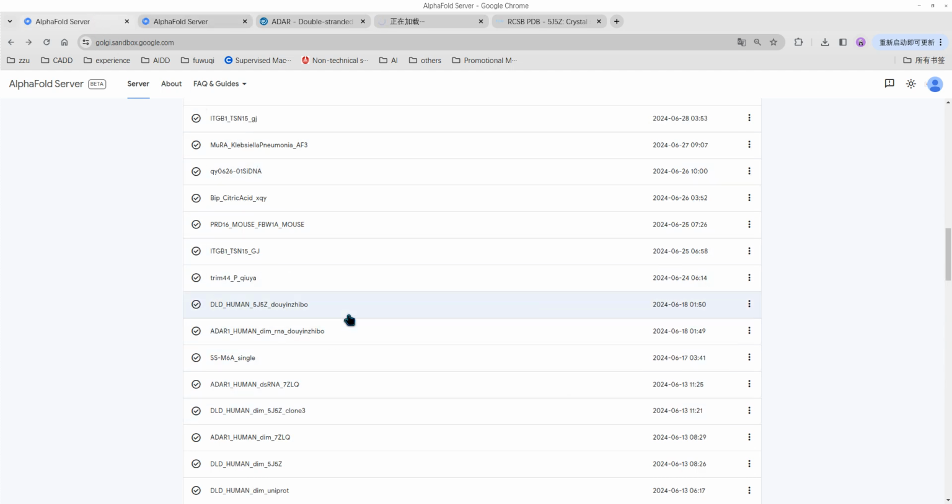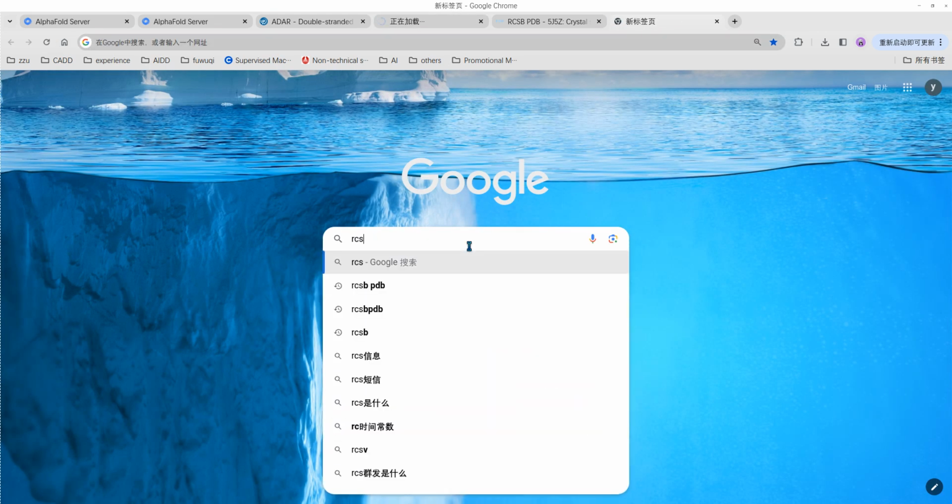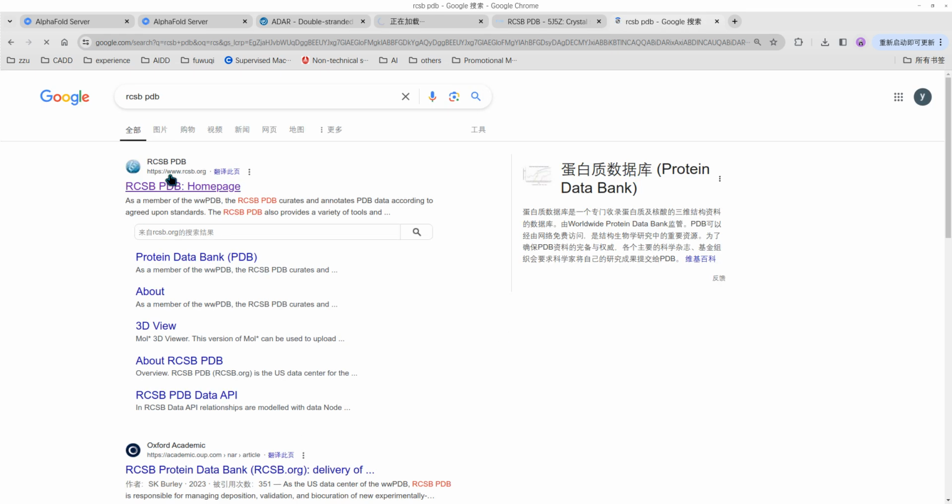8. Open the results we just downloaded. There are .json format files and .cif files. By default, the _model_0.cif structure is selected for analysis. If model_0 is not what we need, we can select other protein structure files for analysis.